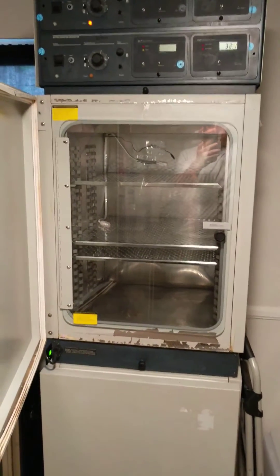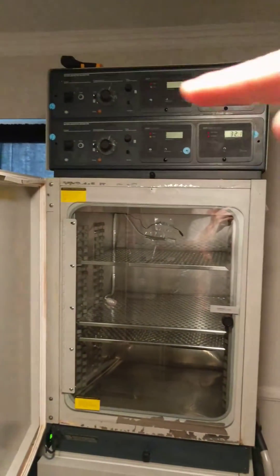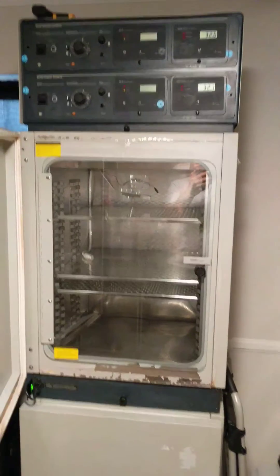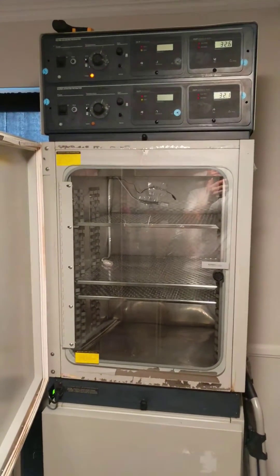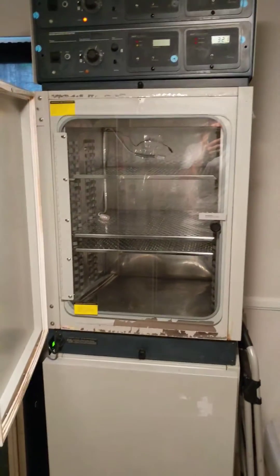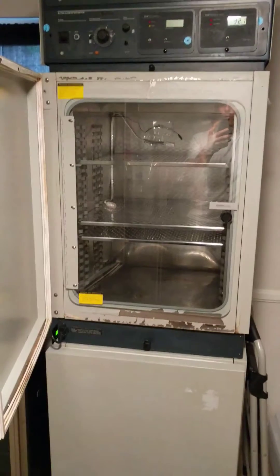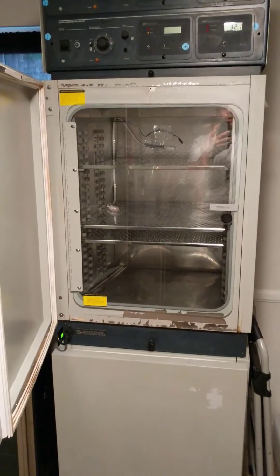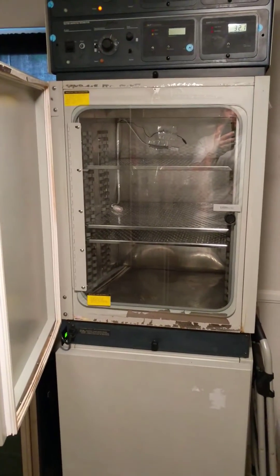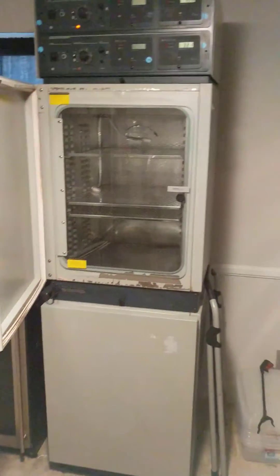What it does is allow the electronic controls up top to control the temperature with very little variance. The upper unit is controlled by the controls up here, and the lower unit vice versa. You dial in your temperatures and the variance is about a tenth of a degree — usually less. Every time the incubator heats up or cools down, it takes a long time to change temperature because you're heating the water surrounding the chamber, not a heating element inside the chamber causing a huge temperature swing.